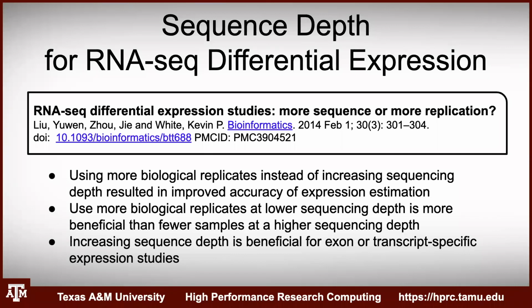So I read a study, and what you see a lot of people do is the bare minimum of 3 control and 3 treatment, right? And that's fine. That's the minimum you can use. But the more biological replicates you have, you actually increase the number of differentially expressed genes that you can accurately detect. And so I believe this study recommended a minimum of 6 per group, and actually recommended 12 per group, which is where you start to recover all the genes that are actually differentially expressed between the groups.